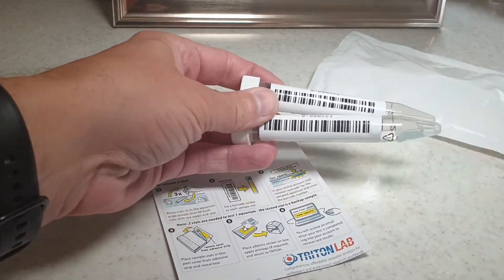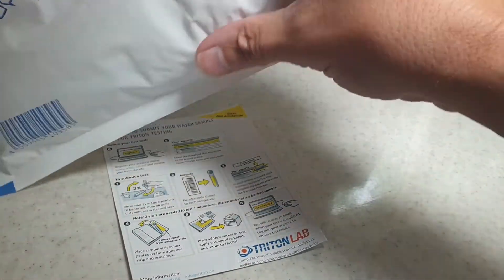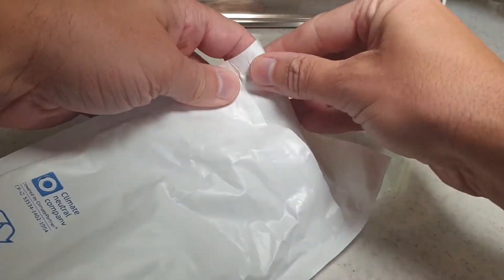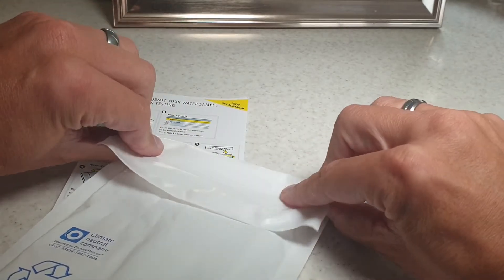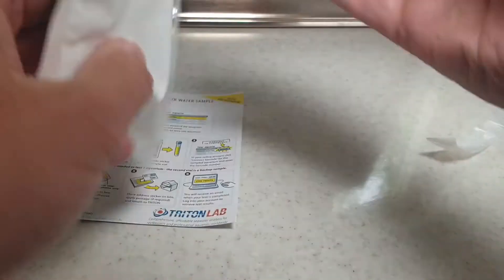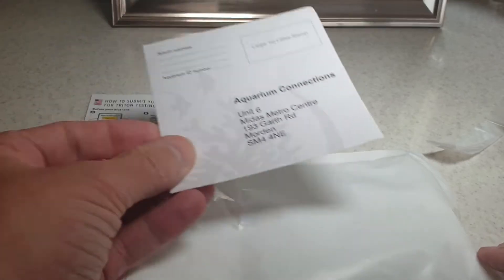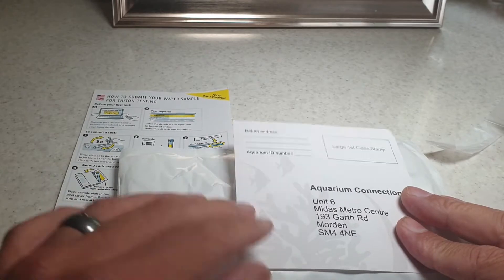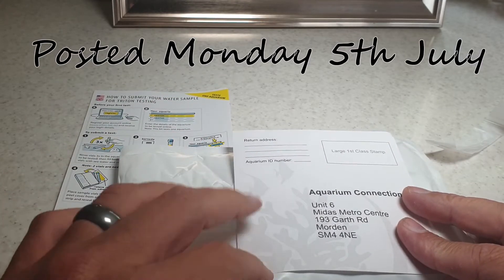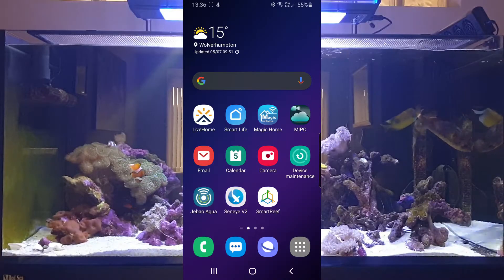That's all done — both barcodes stuck onto the vials. Pop them into the little envelope, seal it up, and on the front we've got the sticker that came with it with their address details. I'm going to stick that on the envelope, add a stamp, put my return address details and the aquarium ID number on there, and pop it in the post.